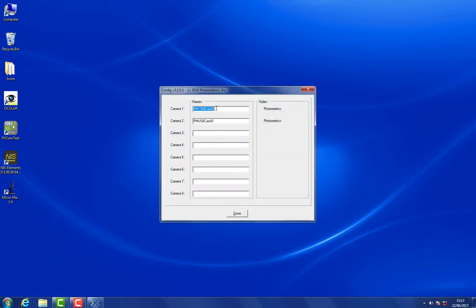In this case I have two plugged in, one that says 1394 and this represents a FireWire camera, so an Evolve Delta. And the other one is a USB camera, in this case a Prime95B.